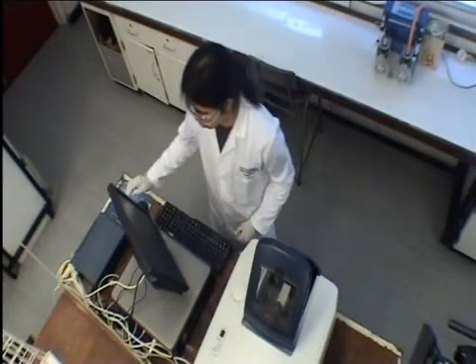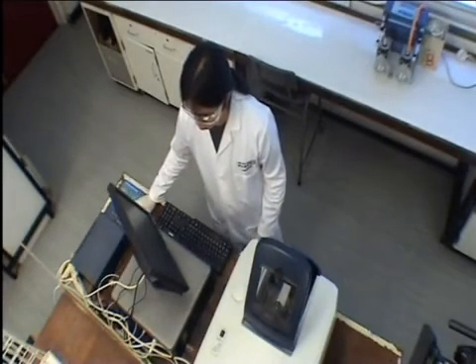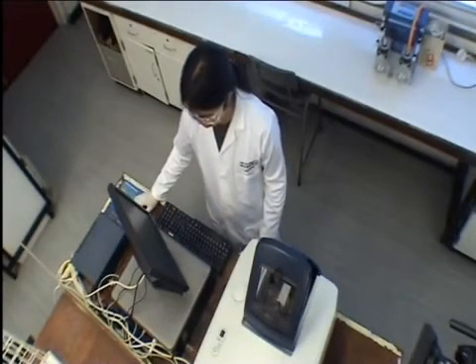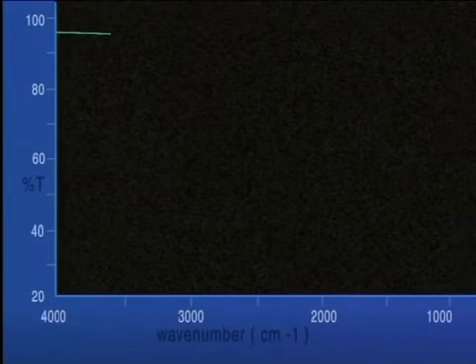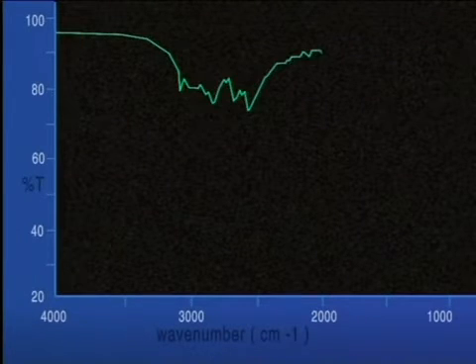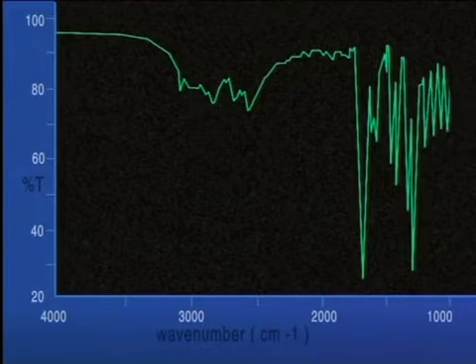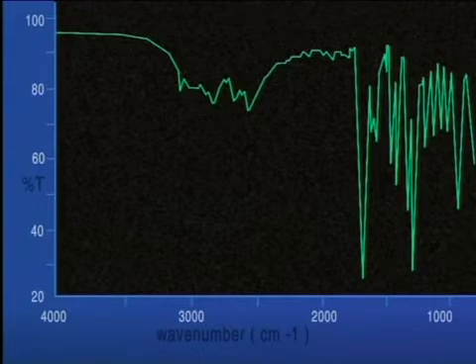Details of the scan are entered into the computer. The spectrum of the sample is obtained within a few seconds. The wavenumbers of the more significant peaks can be labelled onto the spectrum. This helps the chemist to interpret the data.